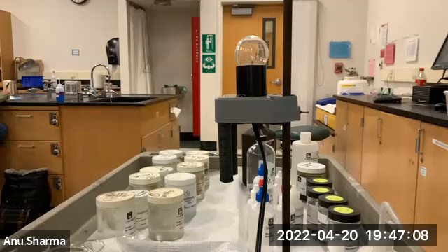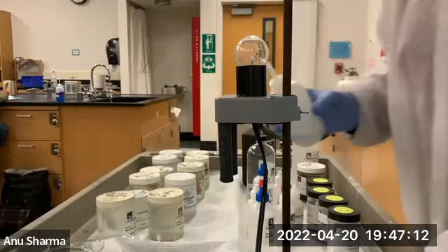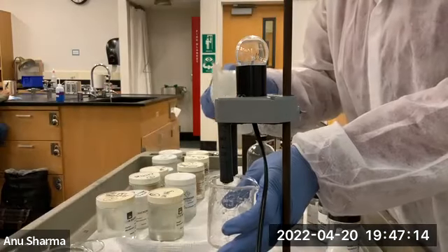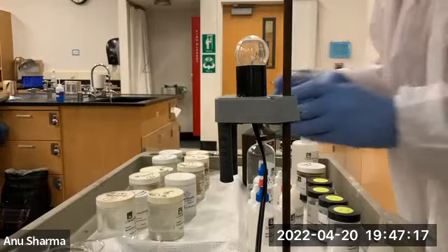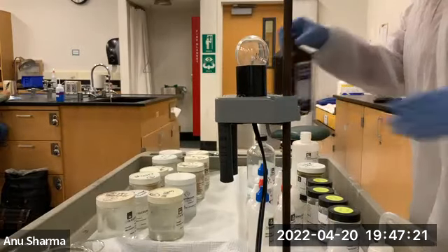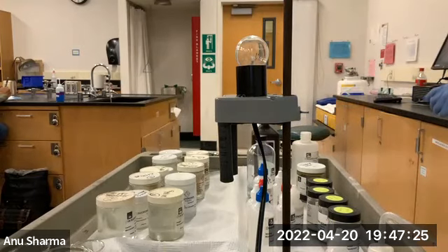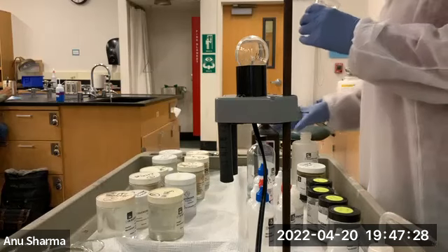Now let's look at hydrogen peroxide. What do you think of hydrogen peroxide? Will it ionize? Hydrogen peroxide, will it mix in water?